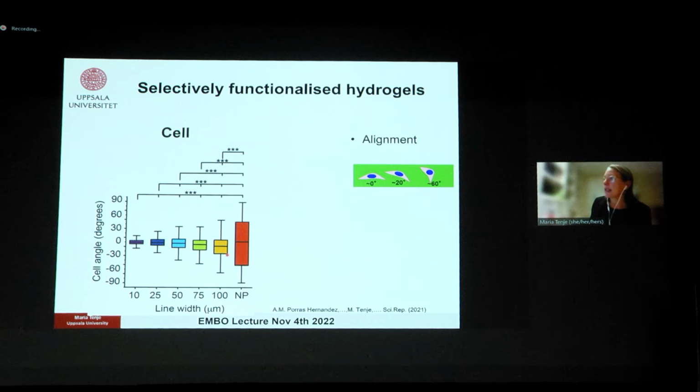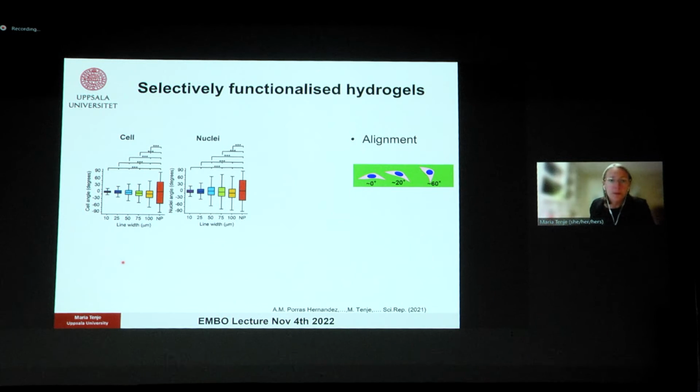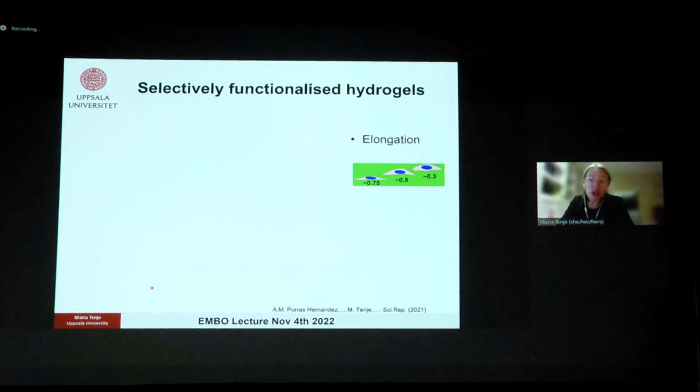But as the line width gets more and more narrow, the cells are approaching zero alignment, so being fully aligned in the direction of the RGD pattern, and the spread also decreases drastically. And the same goes if we look at the cell nuclei. And it's not surprising because the cells are not able to interact with the matrix outside. They need to just stick to this line. If we then look at elongation, and here this is a measure of the eccentricity, so a line is 1, a perfect circle is 0.